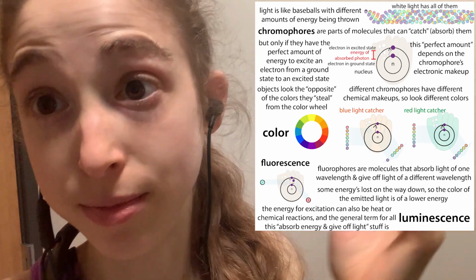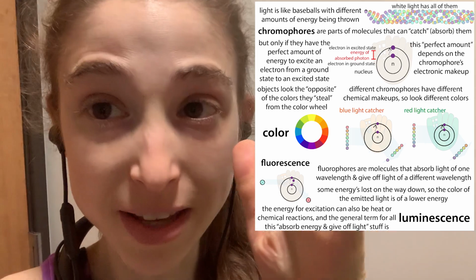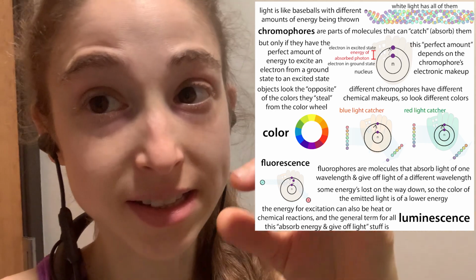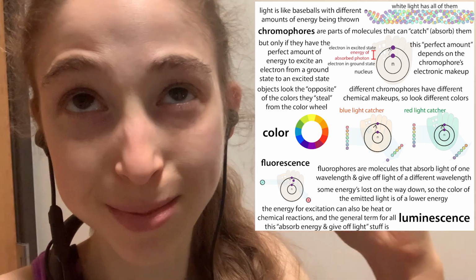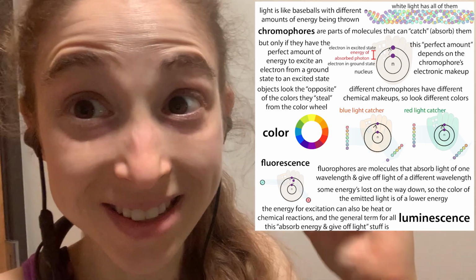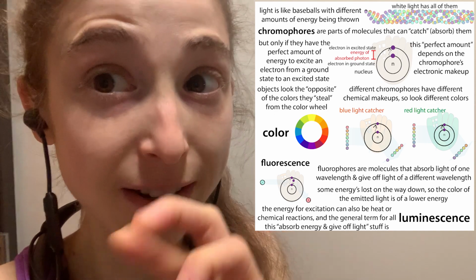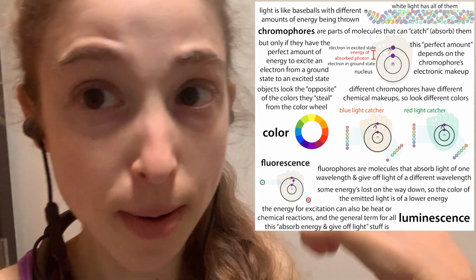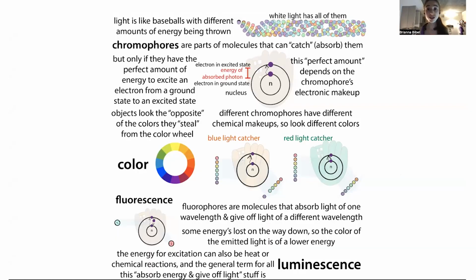Or we can measure the transmitted light, which would be all that was coming in, the incident wavelengths, minus the absorbed wavelengths. Sorry I messed the terms up sometimes, but that is the correct terminology. If I use it a different way later on, I'm sorry, and please try to remember this clarification that I have here. Let's just step back and think about what light actually is.